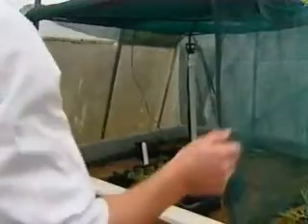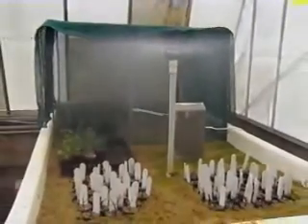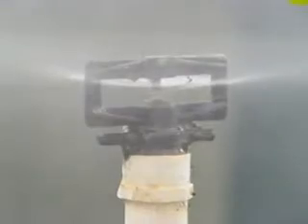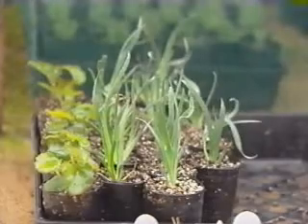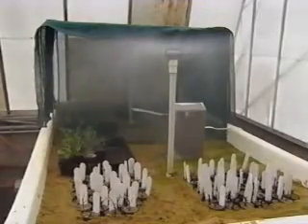At this stage, propagules can be handled in 3 basic ways. First, individual cuttings can be made and planted directly into a rooting medium in mist or under high humidity with or without rooting hormones. In other words, we treat them like soft cuttings.